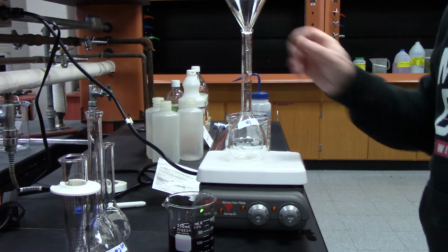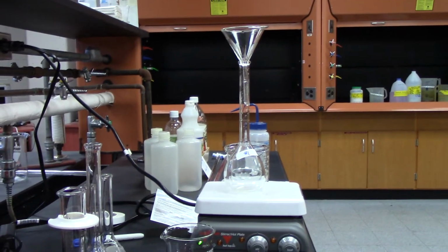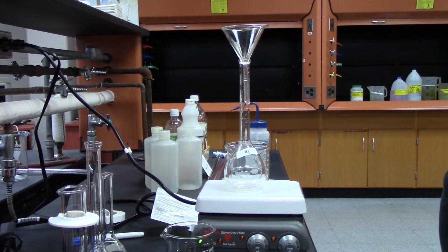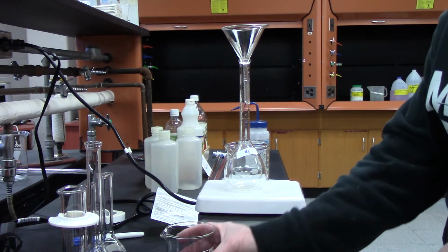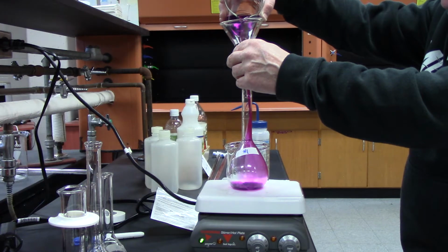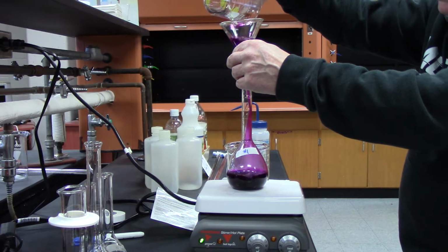Okay, so I'm going to add, funnel down. This is a really good life skill to have if you're going to work in a lab. My second job in a lab was to make solutions, because you're making them all the time, especially if you get into biology or biochemistry. So, I have my funnel, and what I want to do is add my liquid.